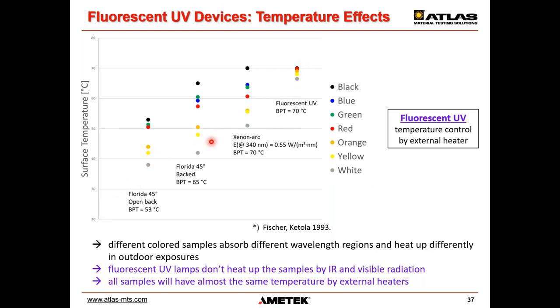This is Florida. Florida, so natural exposures, and the xenon arc instruments which follow the natural exposures. And here, this is the narrow temperature window produced inside a UV fluorescent device for different colored specimens. They're almost all the same.